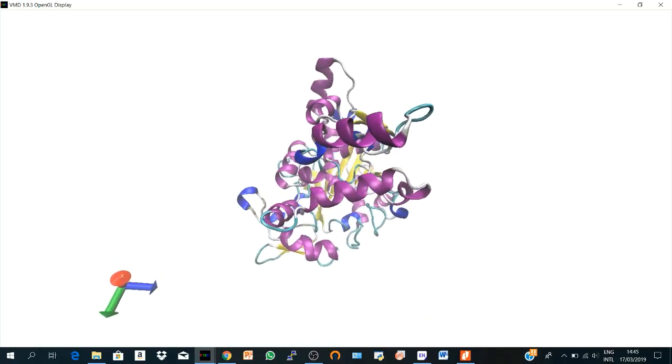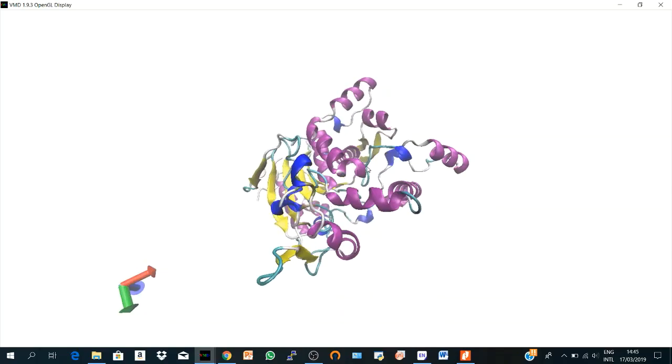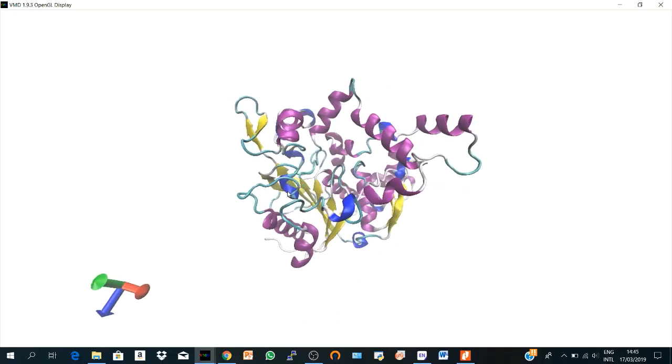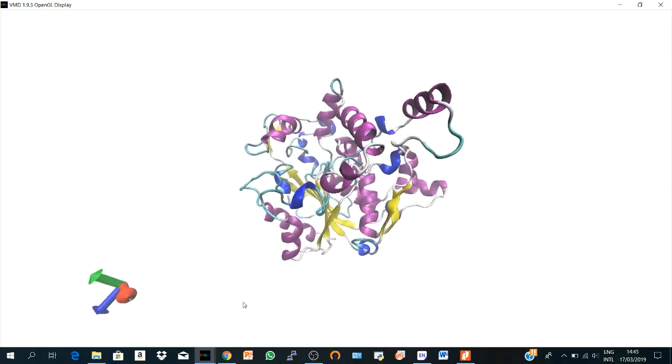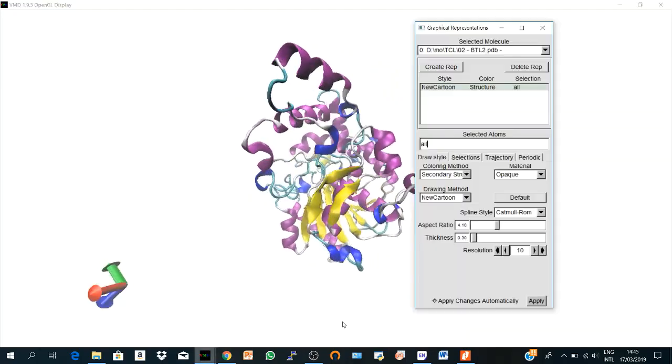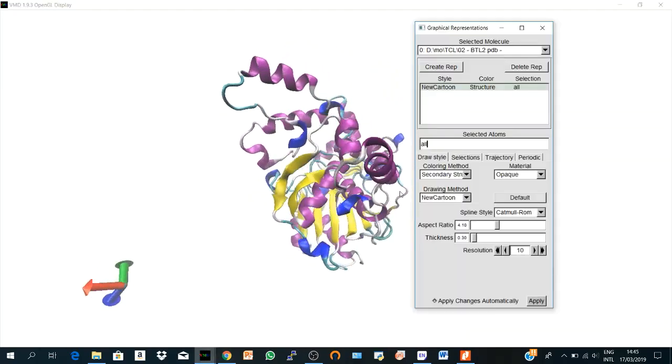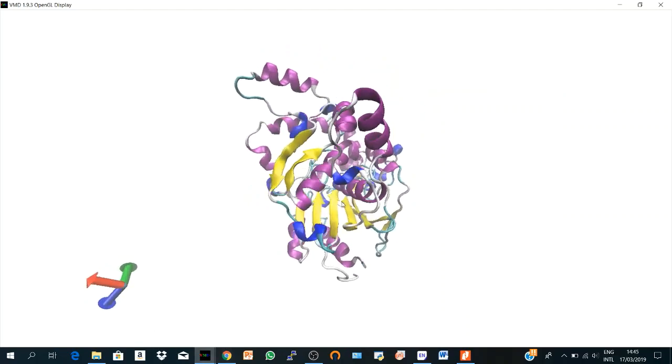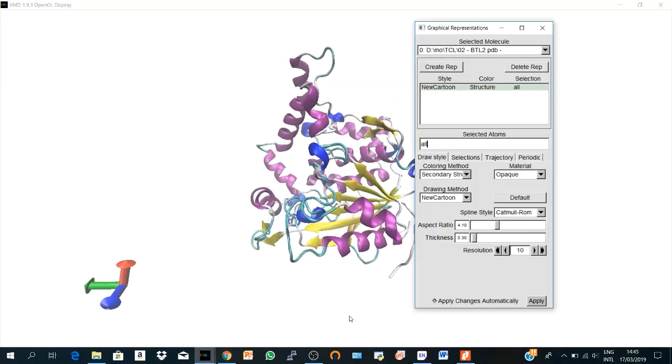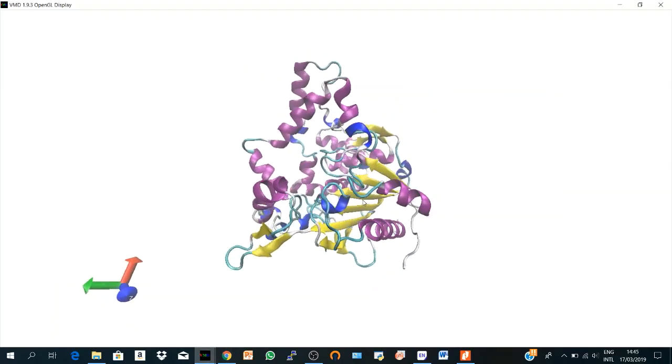So we can zoom a little bit. So here my protein is represented according to New Cartoon.